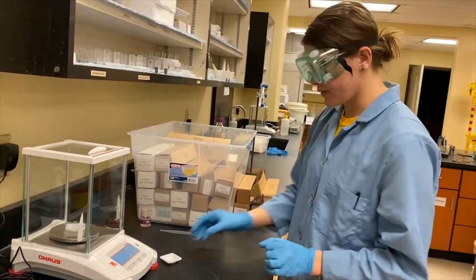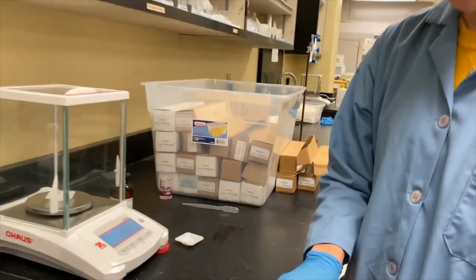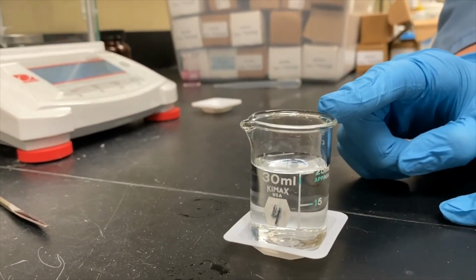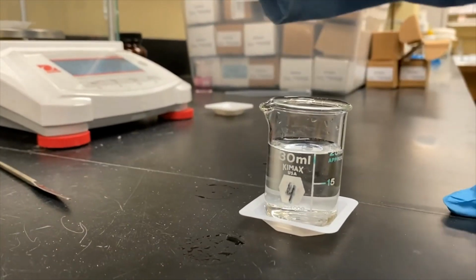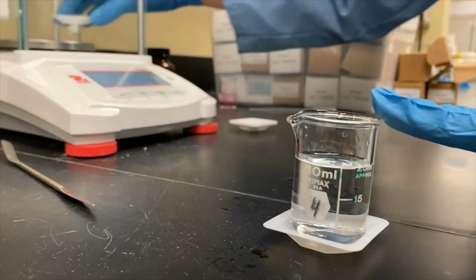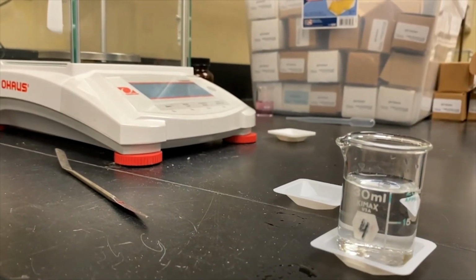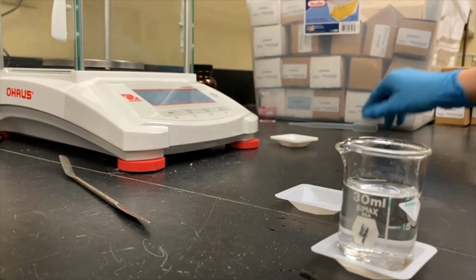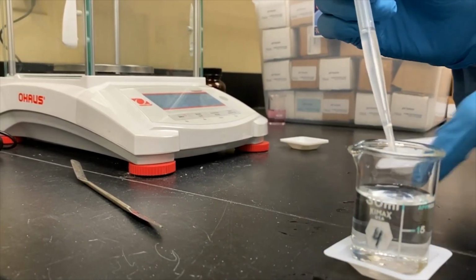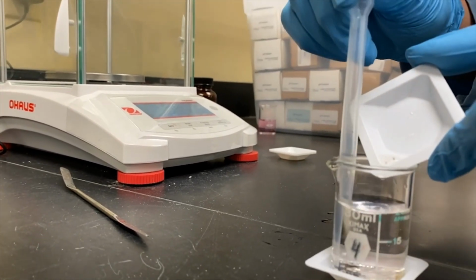So if you look at this solution, it is initially a clear and colorless solution. And what it truly is, is just the tap water from our sink here. This is not DI water, this is regular tap water. And so I'm going to go ahead and add the DPD to it. The way I'm going to do that is take from the solution and then rinse the DPD down. We want to make sure we get all of it in there.